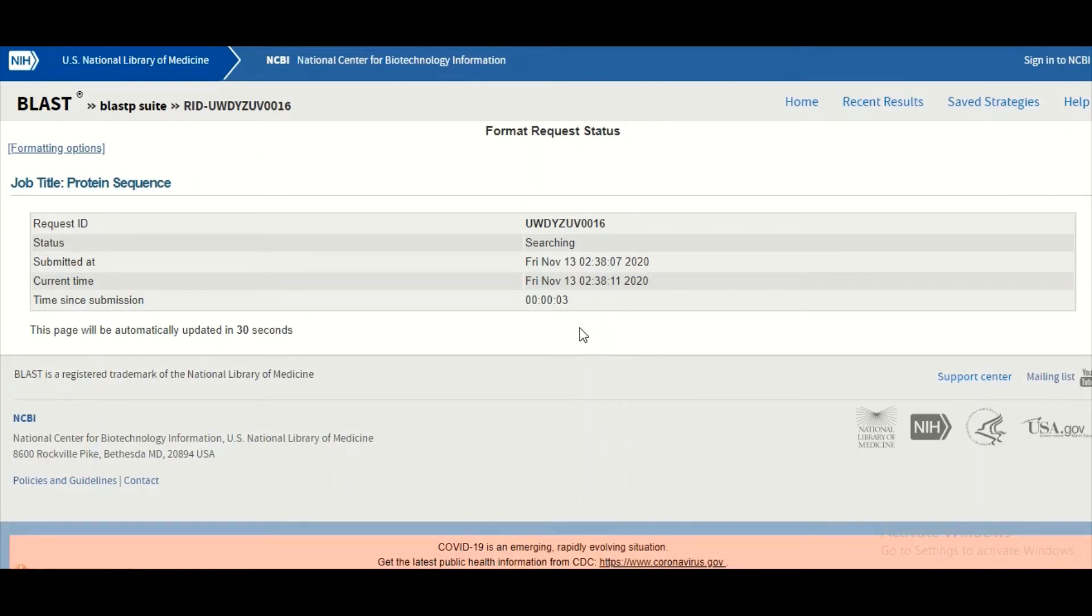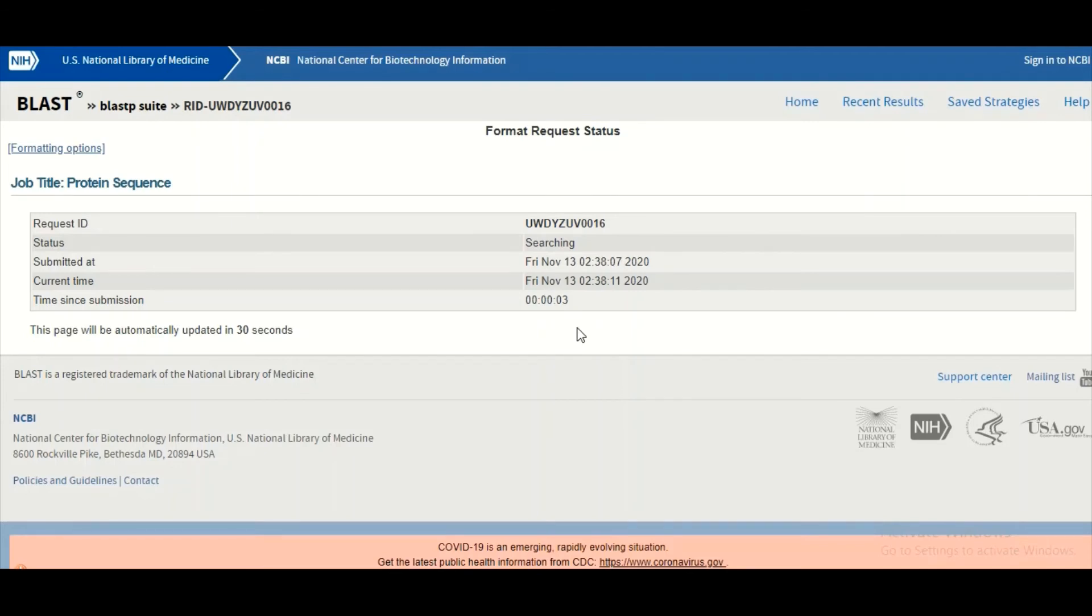We hope you would have a good idea about the PSSM. The PSSM stands for the position-specific scoring matrix. Now based on this PSSM, the consensus sequence will be derived and this consensus sequence then will be used as a query, and then this query will be searched in the database.